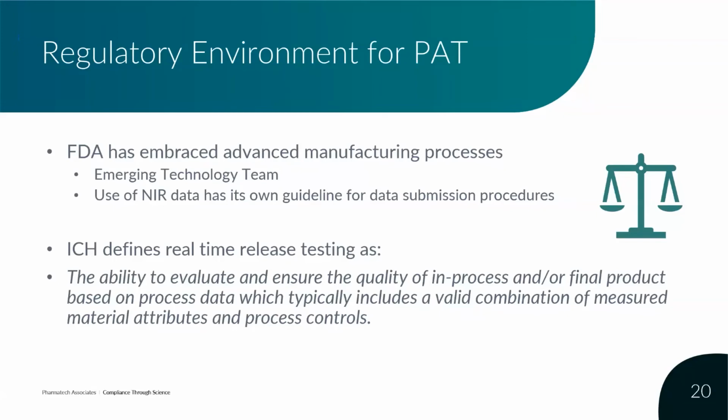You can still take your samples and send them to the lab and go that way. However, it's unlikely that real-time release testing could be implemented without process analytical technology. In fact, I don't see how you could if you have no data other than manual sampling. You're going to be hard pressed, which, as we've already discussed, the benefits here are faster speed to market and reduced analytical testing.